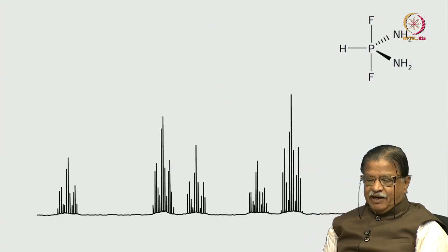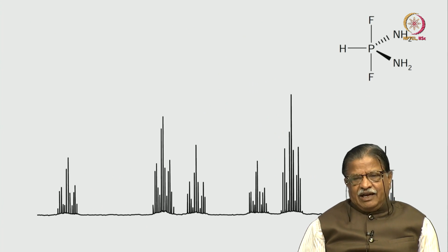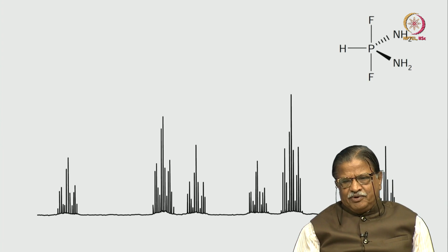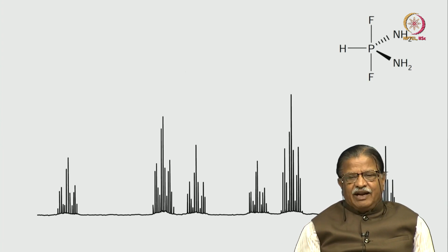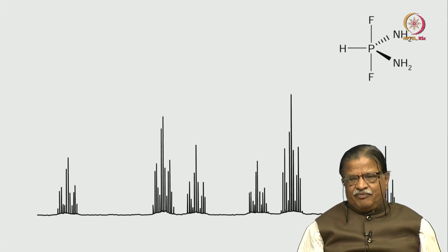And this is the typical spectrum for the phosphorus. Very interesting. You can see this in the book. I have taken this from the book of Inorganic Molecular Chemistry. Fantastic book. When I read that, I saw this very interesting example and I have taken it from them. I thank the author for allowing me to take the spectrum from that book. So, very interesting example. Look at this.